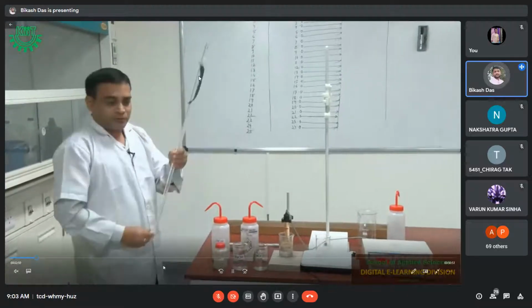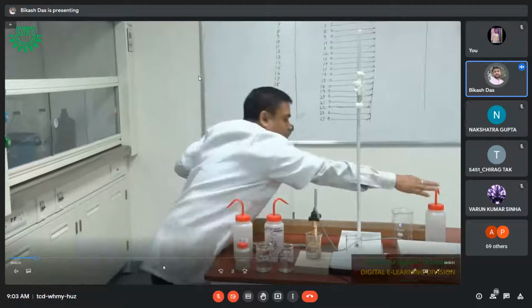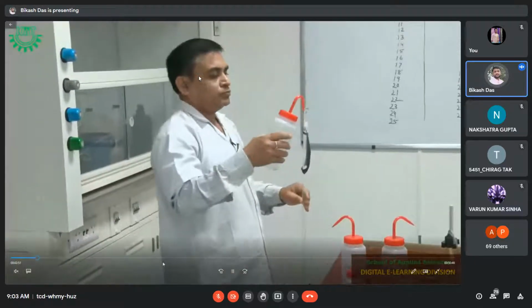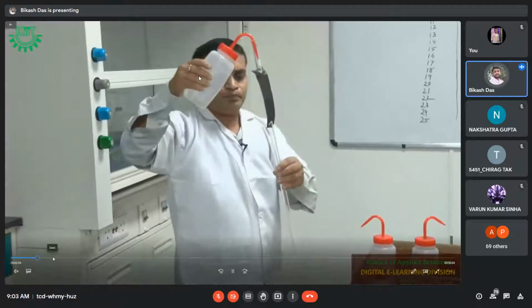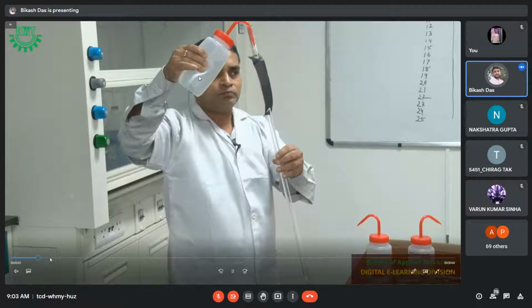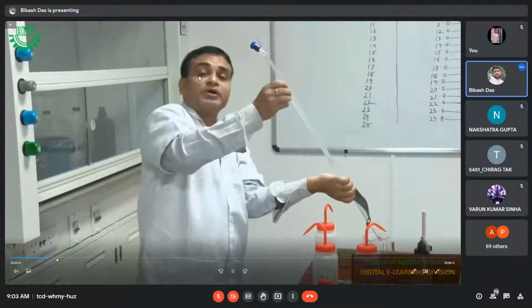Whenever you are doing any experiment, it is your first duty to wash all the glassware with distilled water and then with the respective solutions. I think that part is known to you, so I can forward the video a little.